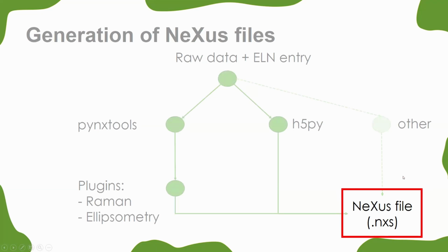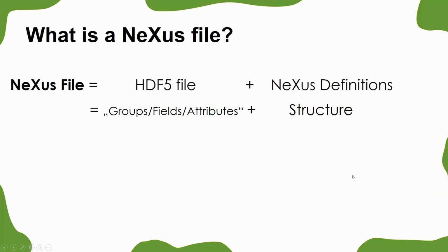And now let's start with the NeXus file. What is a NeXus file? Shanda already gave you an introduction on where all these NeXus definitions and the standard come from, what it covers, how it is structured, what the possibilities are with that, and the potential. In short, I just have a quick equation for you. A NeXus file is sort of just an HDF5 file.